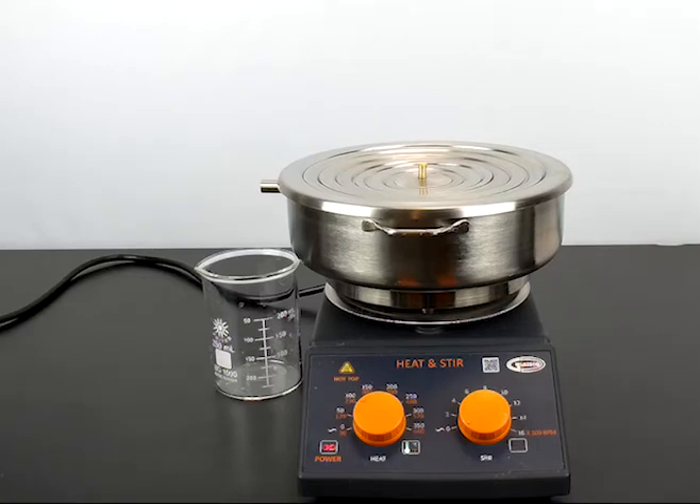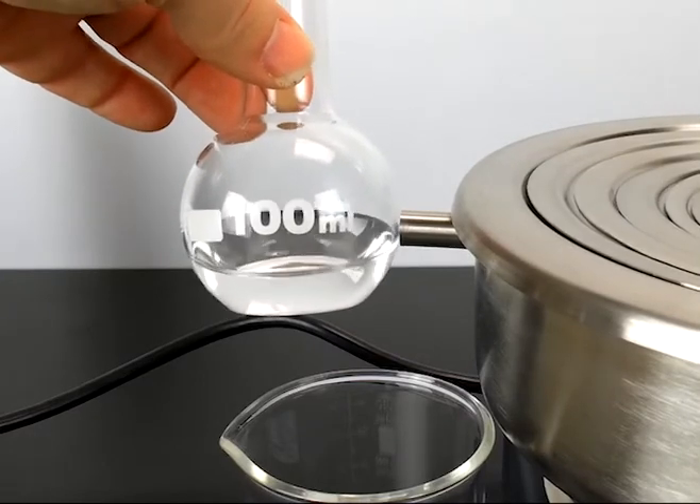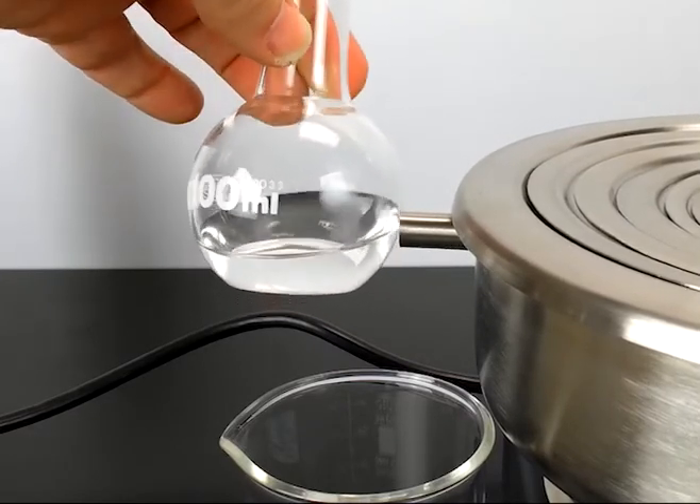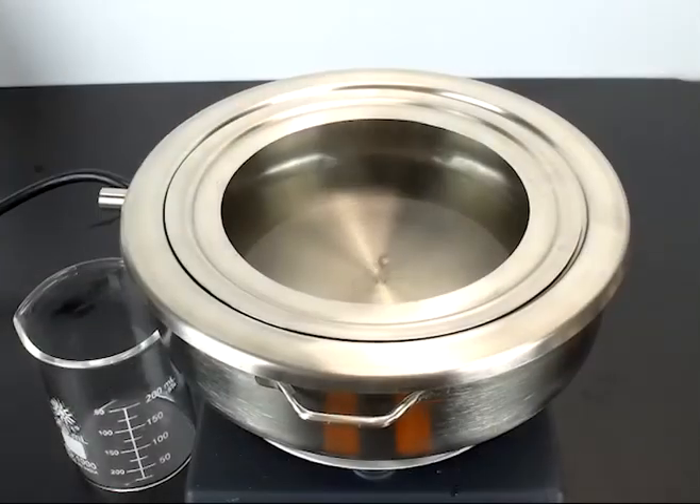I have filled the water bath tank just below the steam nozzle, and I have also placed a beaker just underneath it. This is boiling, but even though you do not see the steam, it is coming out as you can see the condensation on this flask.